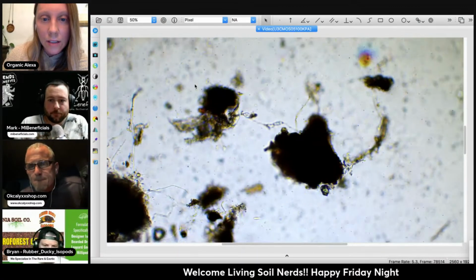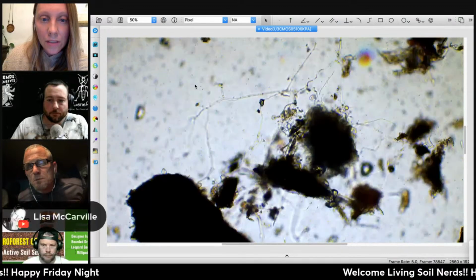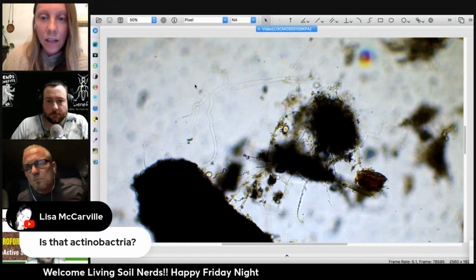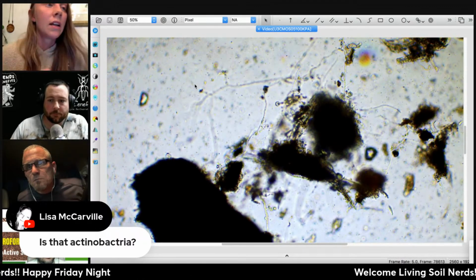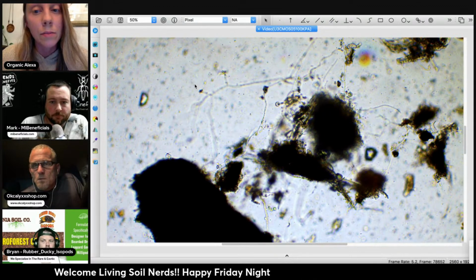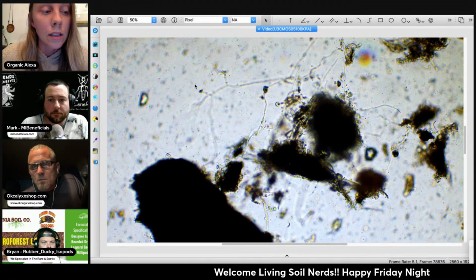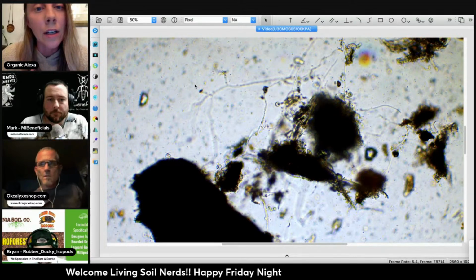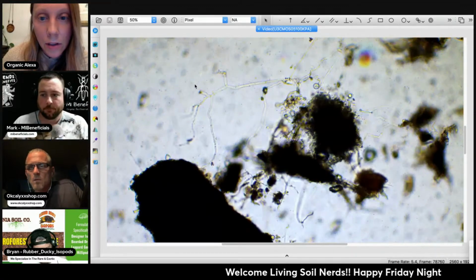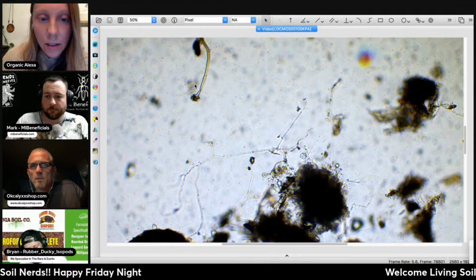I see these in soils all the time, in inputs that I'm making all the time, and I've only seen beneficial reactions from it, especially in the compost teas that I make. I think a lot of times when it's white like this, it's because the fungi is growing really rapidly. It has a food resource and it's growing really rapidly. And then as it ages, fungi actually have melanin in their cell walls, and that's one of the things that makes them brown over time. So as they grow and store carbon and different nutrients, they become different colors.